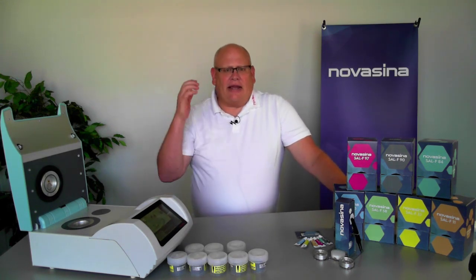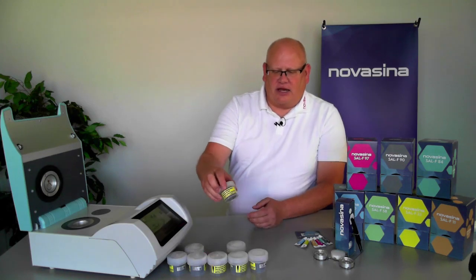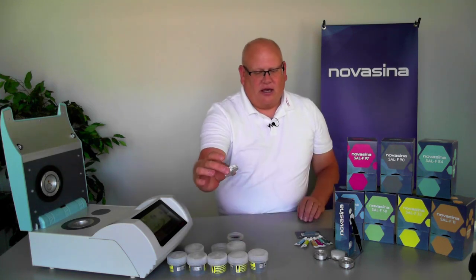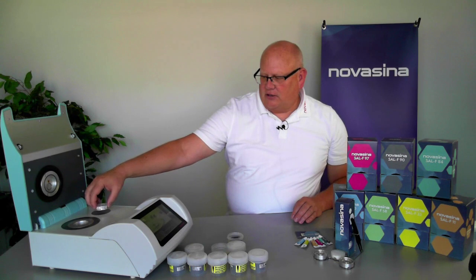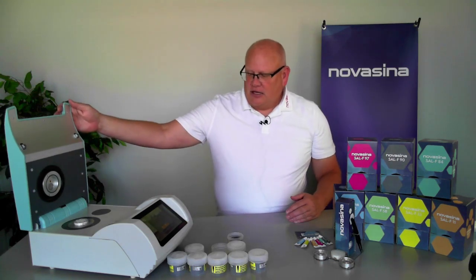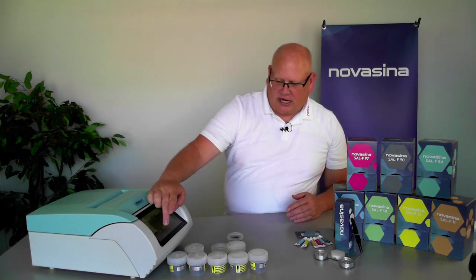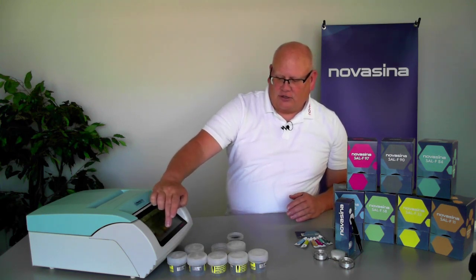Now we're going to show how you would run a calibration verification with each standard type. Starting with the SAL-T — the reusable standards — we keep them in a container and want to keep that container nice and tight when not in use. The standard is a disk, and when you place it on the NEO's RFID chip, it will recognize what that standard is. The instrument will come up and tell you it sees a 75 standard and ask you to confirm, then ask if you want to start a calibration or verification. You confirm and it begins running.